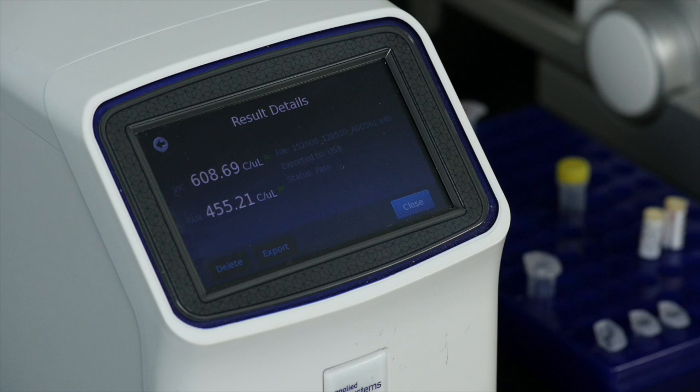ROX is used to confirm sample presence in well. Lastly, data is written to a user-defined destination: instrument, USB drive, networked server, or cloud-based analysis suite software.